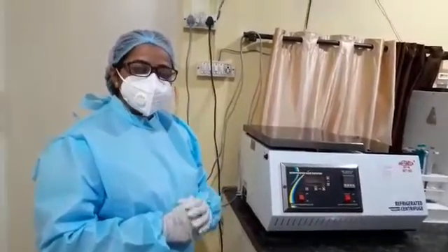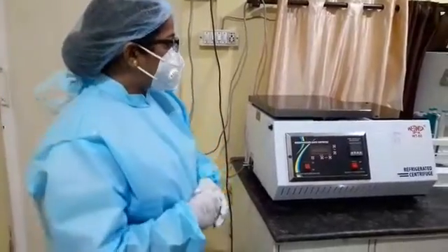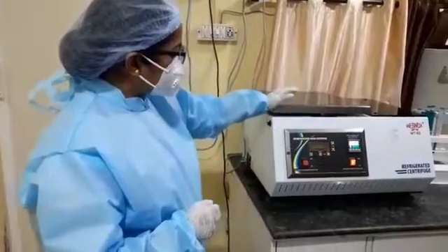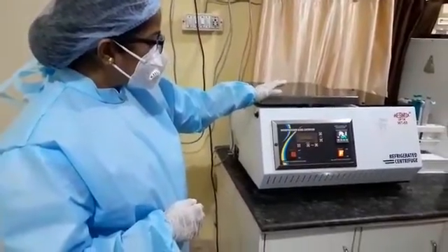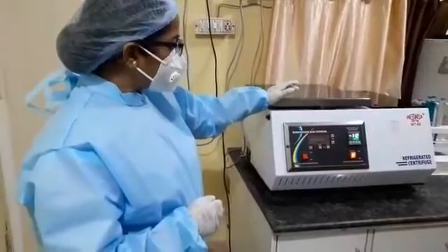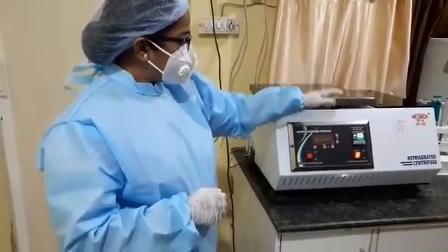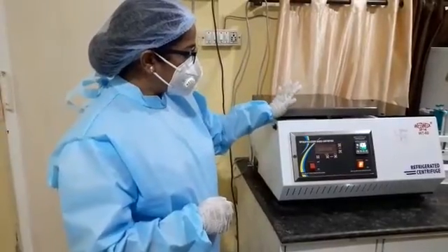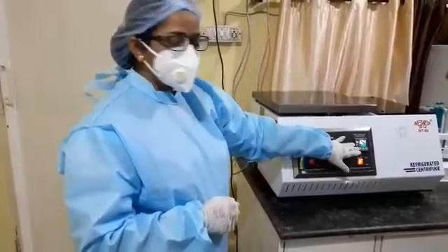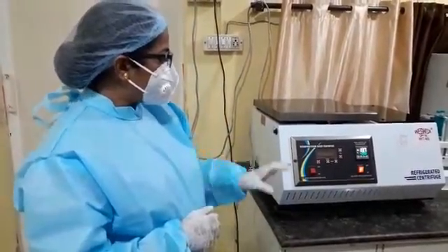Then we switched to a refrigerated centrifuge, where we can reset the temperature down to minus 20 degrees. You can change the temperature according to your convenient level. We set it to minus 20 degrees, and the centrifuge automatically changes from room temperature to the required temperature.